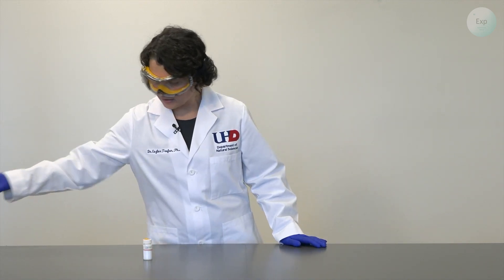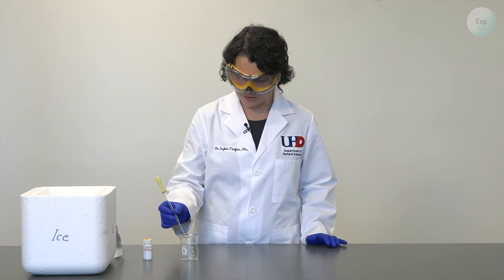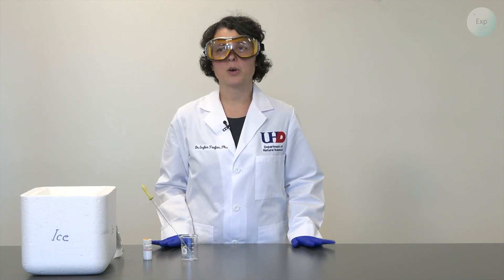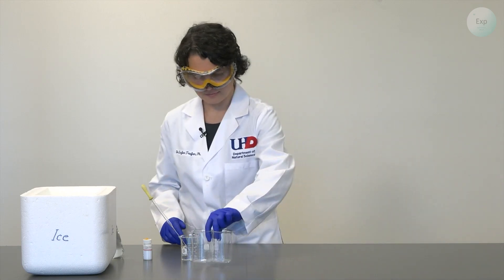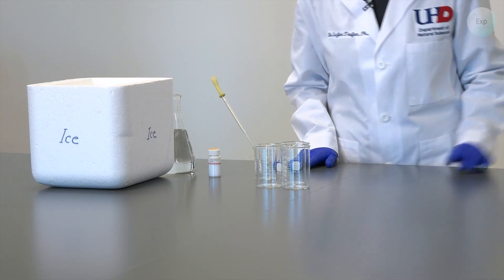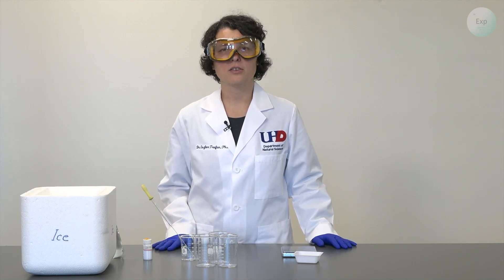So for this experiment, we're going to need some sodium chloride, some deionized water, and some ice. And then, because I want to make sure that I'm measuring the appropriate amounts, I'm going to bring in an extra beaker and a pipette. Because we're going to perform three measurements at once, we're going to use three approximately 150 milliliter beakers. We will need to know the mass of the sodium chloride that we're adding, so we're going to need a scale and a weighing boat.